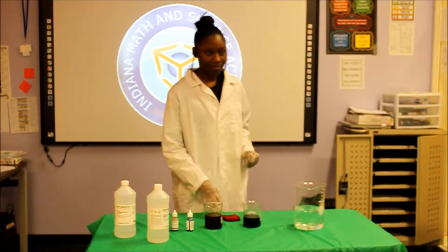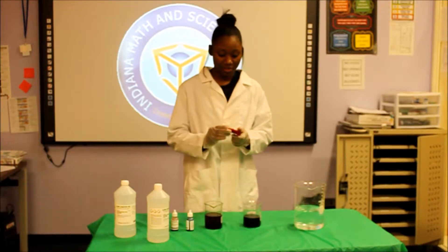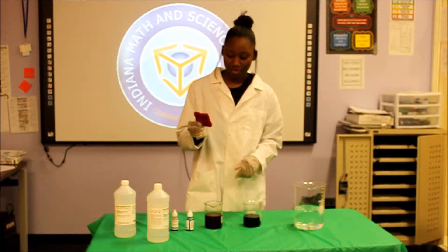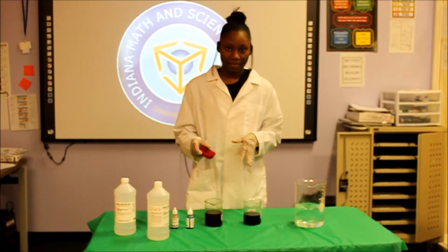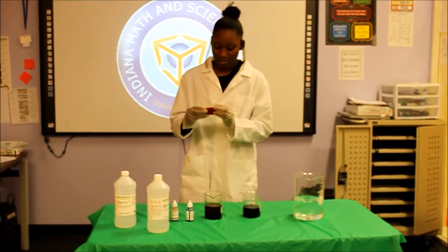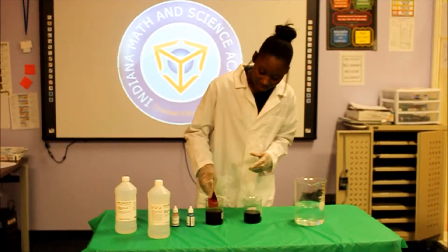What is basically going to happen in this demonstration is I'm going to put this indicator sponge into the red solution and see what happens, and then I'm going to put it inside the blue solution to see what happens. So I'm just going to put it in this red solution.